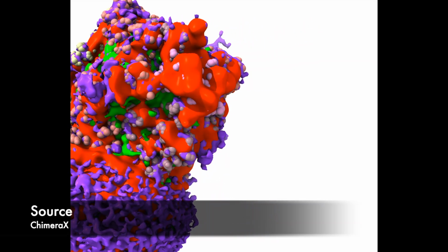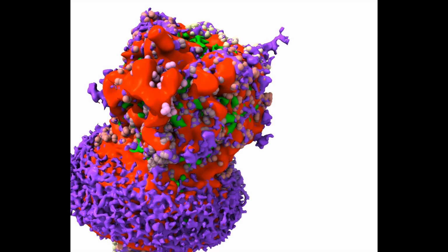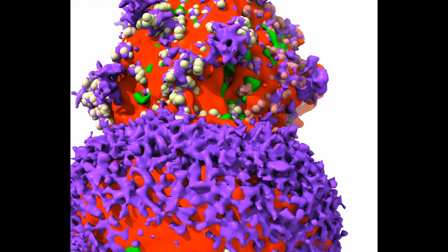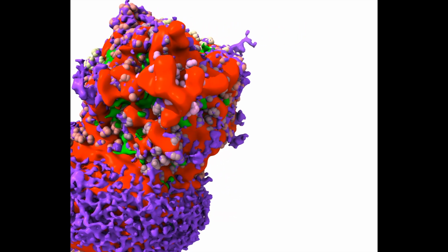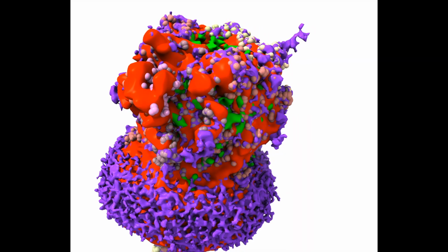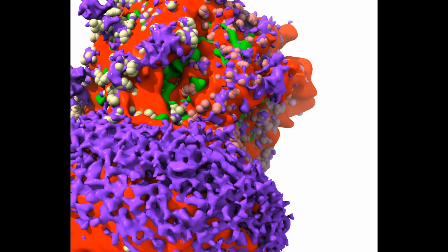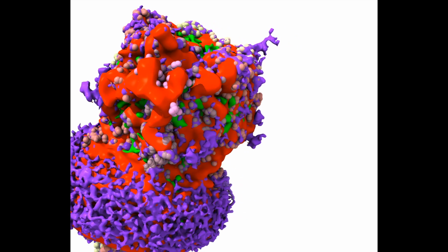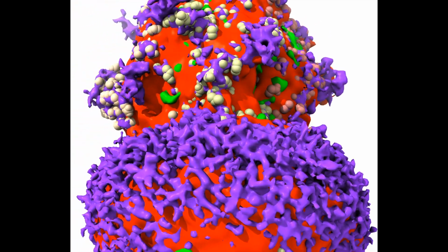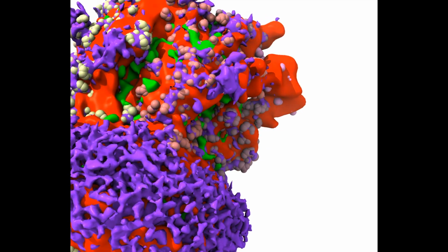I picked some weird colors just so you can tell which is which. Basically you have this purple color, which is just the EM density map with no 3D classification at all. That's just a plain Jane 3D reconstruction. Then you can see the red is the map of the focus mask used to look at the alpha gamma binding site. And you can see it's covering most of this toxin now, which actually looks a lot better than previous maps did. And then poking through the middle there is the green, which is mainly giving us an EM density map for inside of the pore.